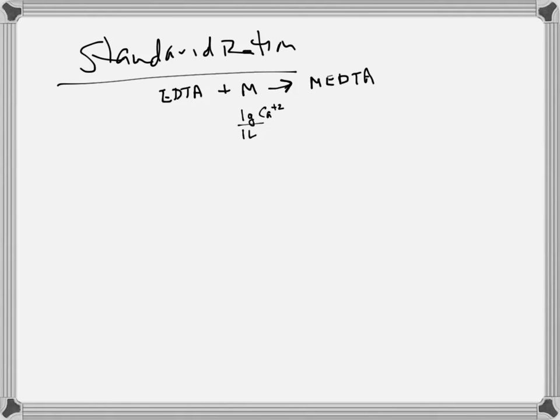I think you had it. No, not quite. It is a metal though. We have 10 milliliters of it. Was it really only 10? Yeah. Oh, okay. So we've got 10 milliliters. So why is that helpful? I can do a conversion where I can now convert the milliliters of calcium ion into grams of calcium ion.